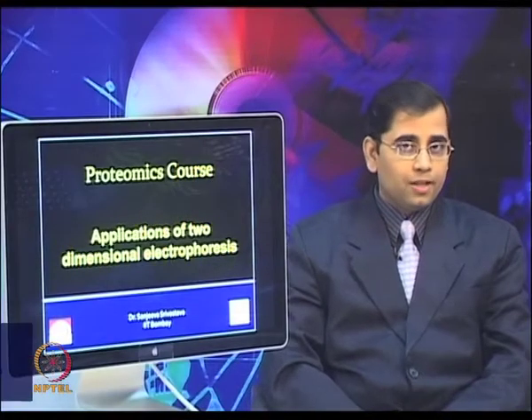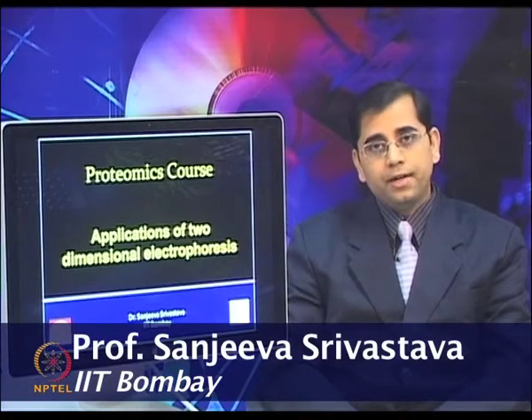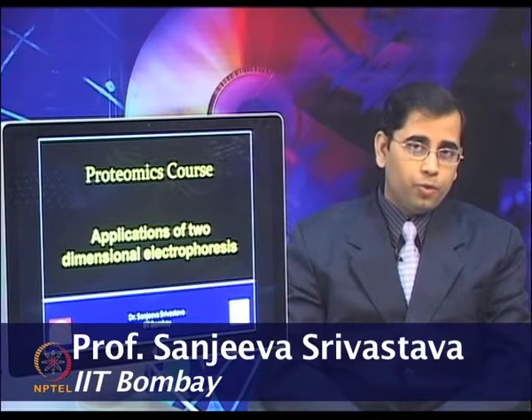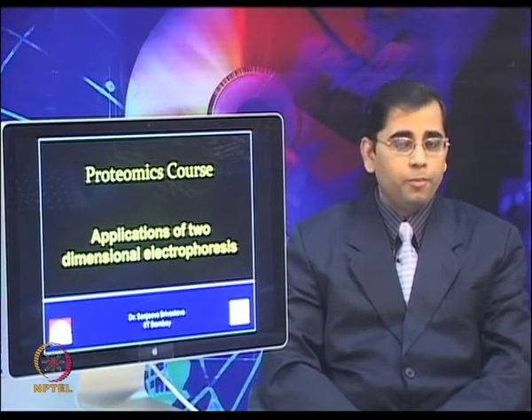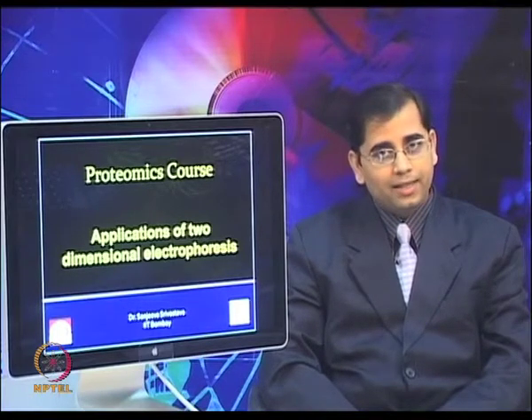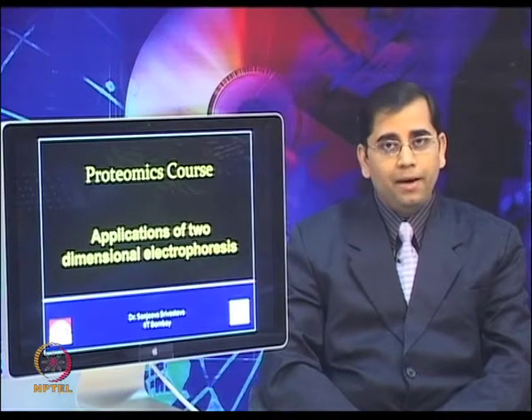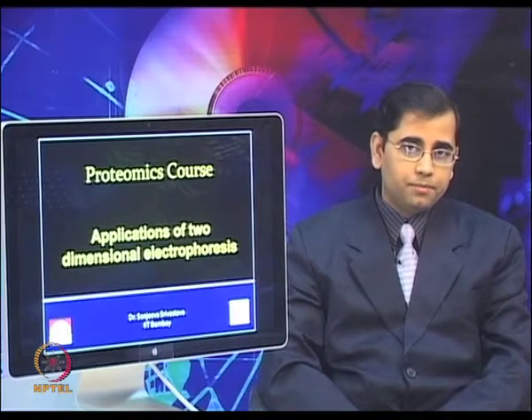In the last few lectures of this module, we discussed the two-dimensional electrophoresis technique. We discussed in much detail the workflow, the various steps involved in performing two-dimensional electrophoresis, and difference in gel electrophoresis. Now, today we will talk about how these techniques can be applied for understanding some biological questions.